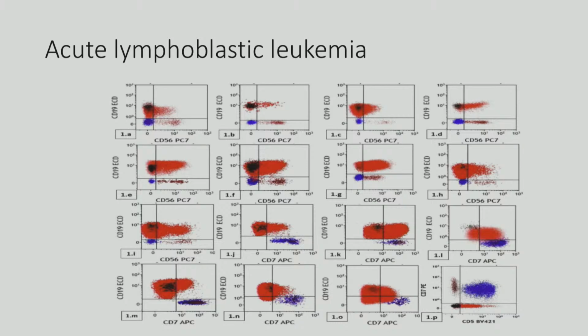For a mixed phenotypic leukemia, there are specific guidelines like the European Leukemia Net guideline where a particular marker is used if it is positive. Say we have a B cell phenotype mixed with a T cell phenotype. There is a scoring system with CD19 positivity or CD10 positivity, or TDT and CD3 positivity. If there is a myeloid component, then MPO and CD33 are used as myeloid markers. So this particular flow diagram shows that it is a B cell leukemia with aberrant expression of CD7.